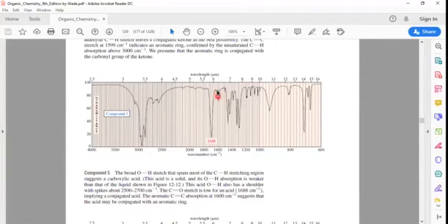Here, these are the carbon-carbon stretching absorptions because of the aromatic carbon-carbon double bond. So this is again a carboxylic acid where the carbonyl group is attached to the ring. So this is the most probable prediction that we can make.